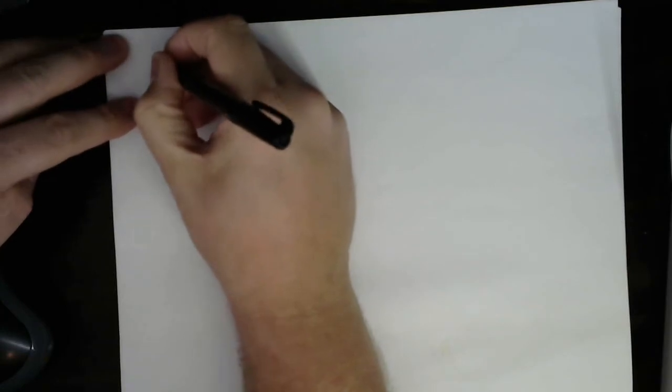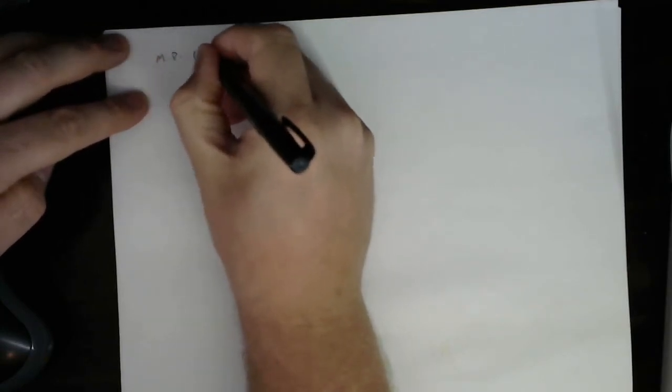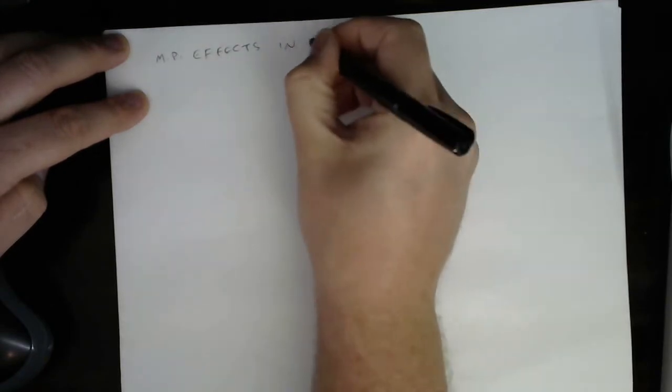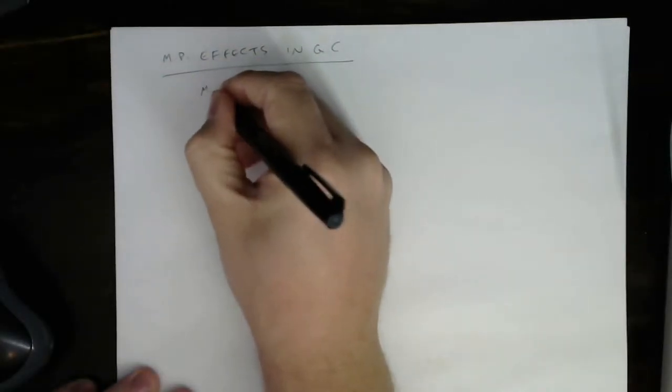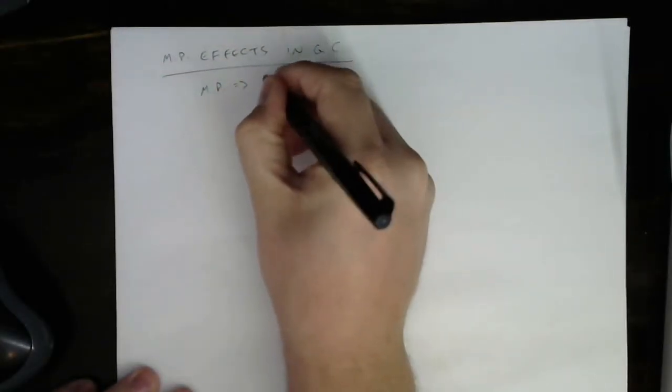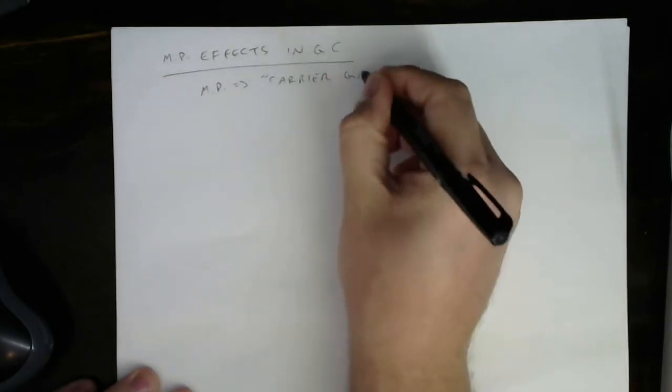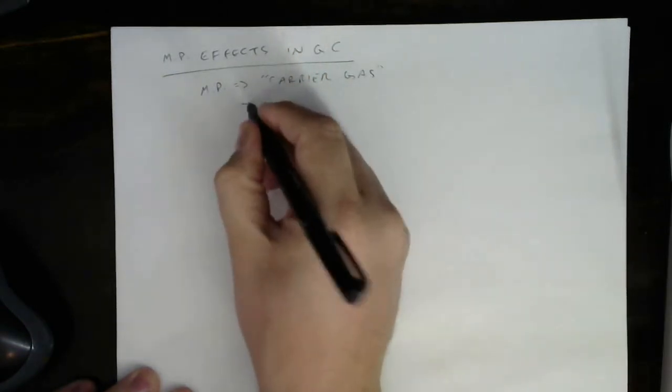All right, we'll finish up today with a brief discussion on mobile phase effects in gas chromatography. So we've said that we call the mobile phase the carrier gas. We do this because that's all it does. That's the function of the mobile phase in gas chromatography.